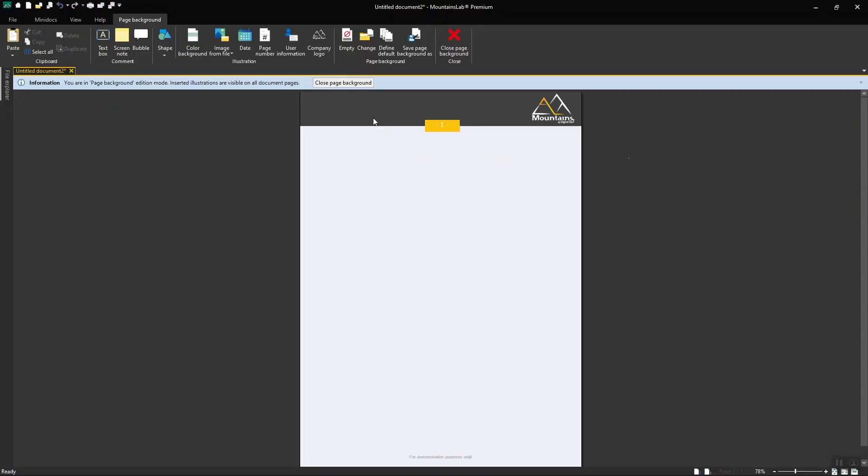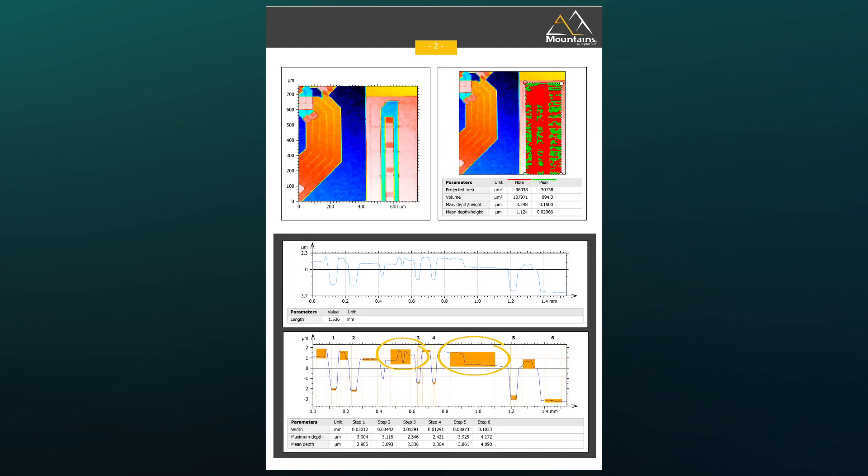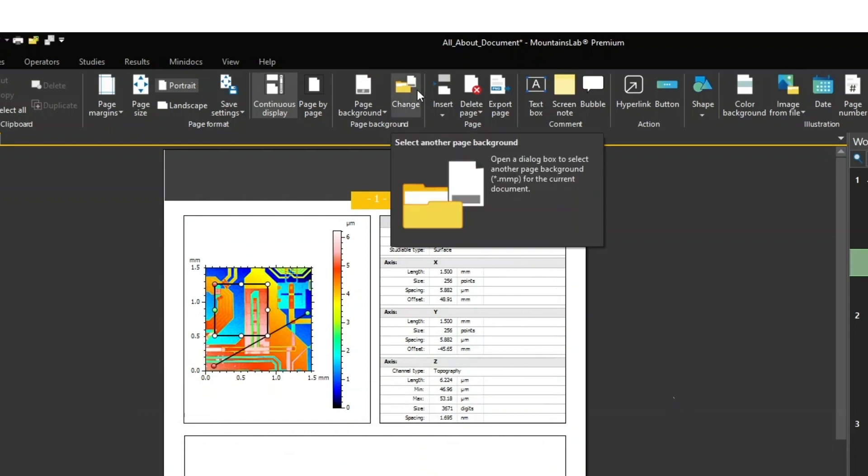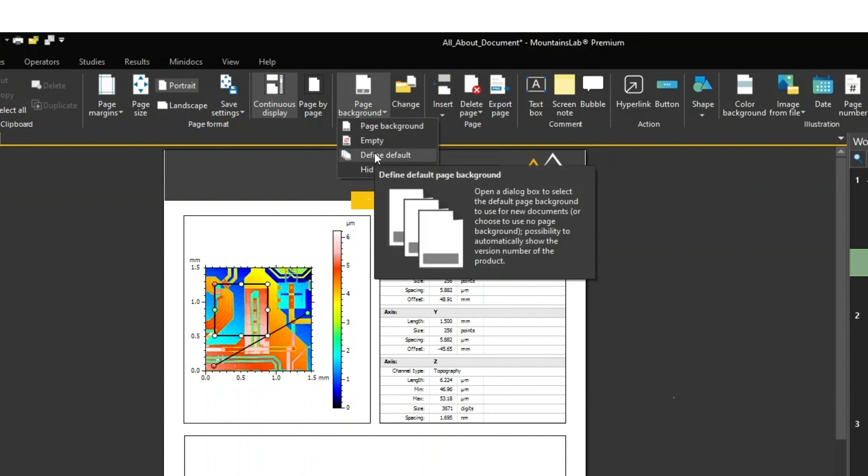To come back to my document, I click on Close Page Background and the background I created is applied to the other pages in my document. To load a pre-existing background, just click on Change in the Edit tab. You can also define a default background to be applied to any new document.